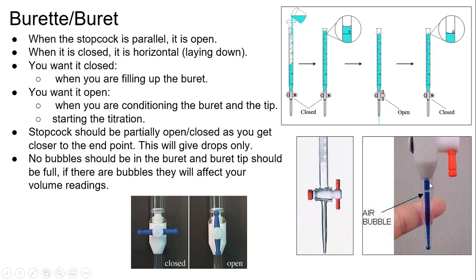Air bubbles. Air bubbles are another thing you do not want. Like I said, this experiment's very sensitive, so even having 1 air bubble can throw your measurements off.